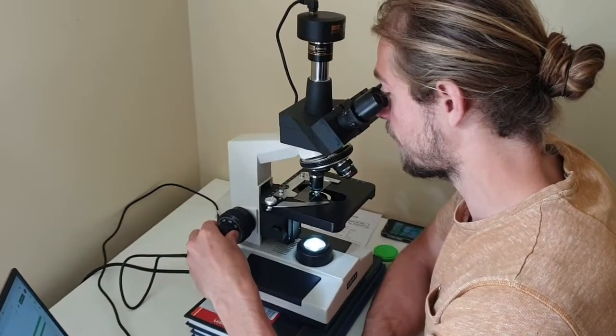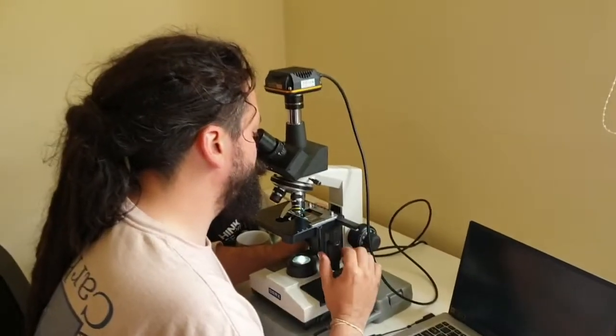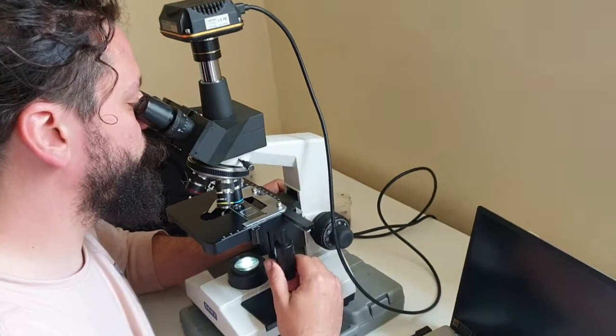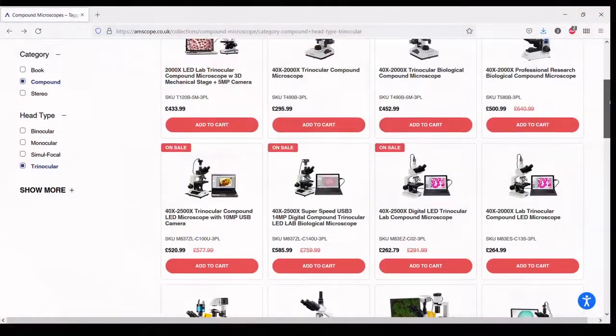Hi, it's Daniel from the Sorrel Ecology Laboratory and today we'll be unboxing an OMAX trinocular compound microscope. We're not affiliated with OMAX or Amscope who supplied it but purchased it outright. Here in the lab we own several of them and we find them appropriate for soil food web analysis and training. They are easy to use and relatively inexpensive.